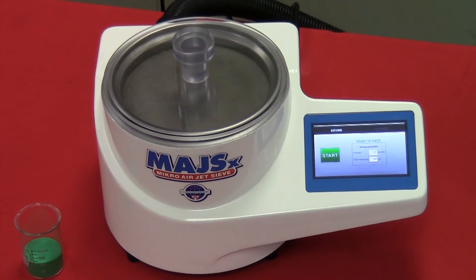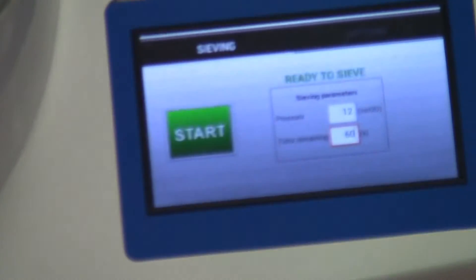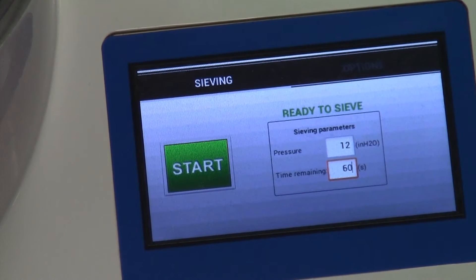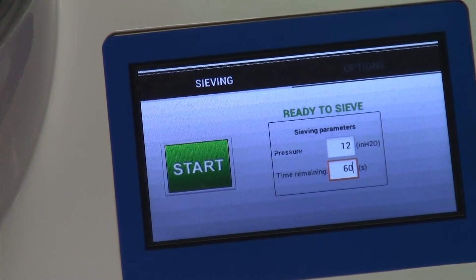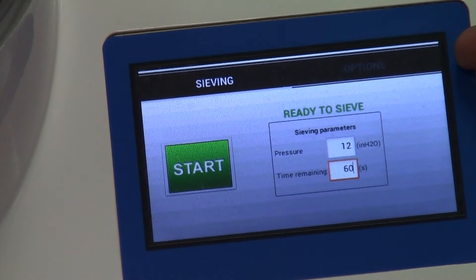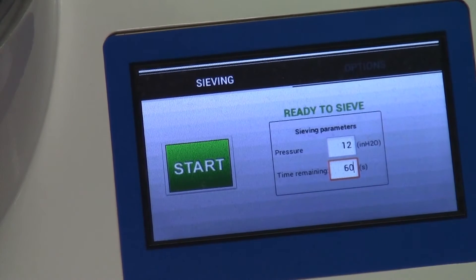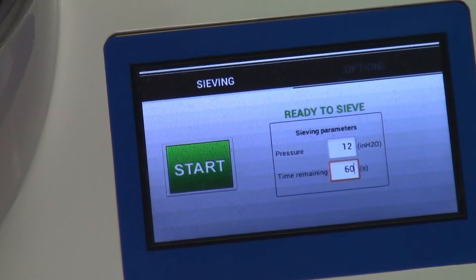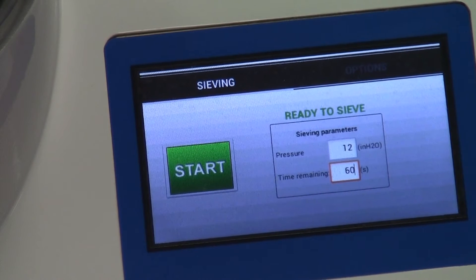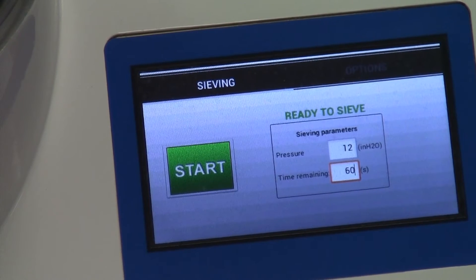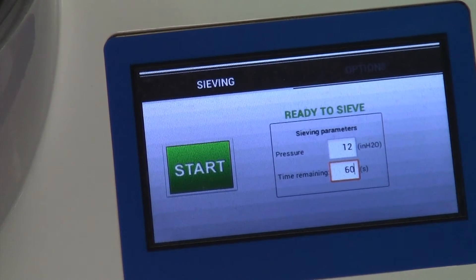In order to operate the Air Jet Sieve, we're going to enter in our sieving parameters. As you can see here on the screen, our sieving parameters consist of the pressure and the time remaining. For the pressure, we at Hasekawa suggest anywhere from 8 to 16 inches water pressure, and for the sieving time, we suggest 120 seconds or 2 minutes.